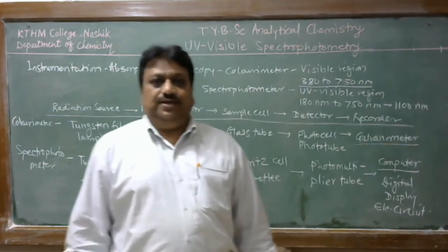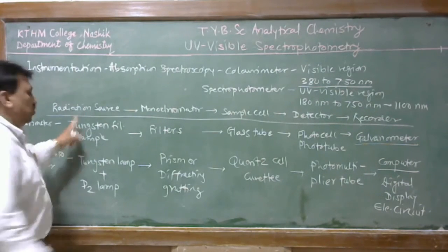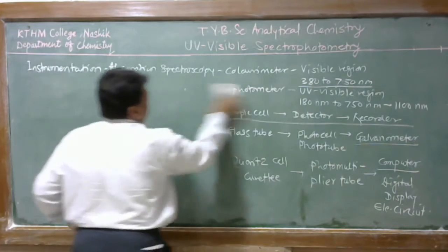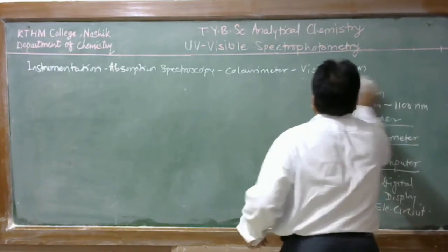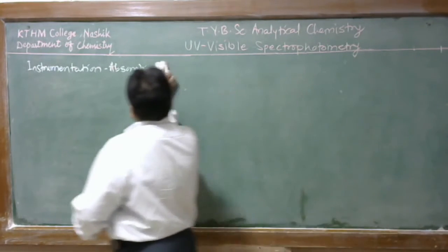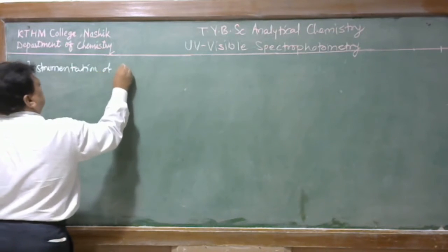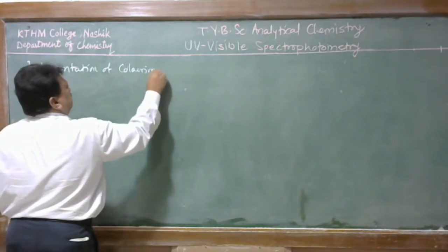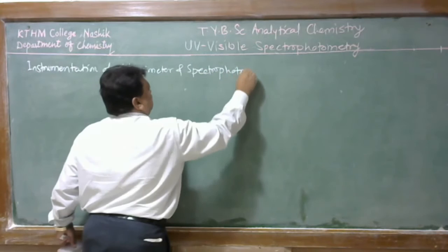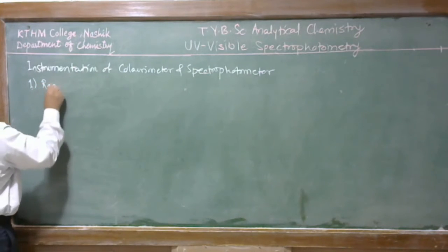Now we discuss the first component of the instrumentation, that is the radiation source.